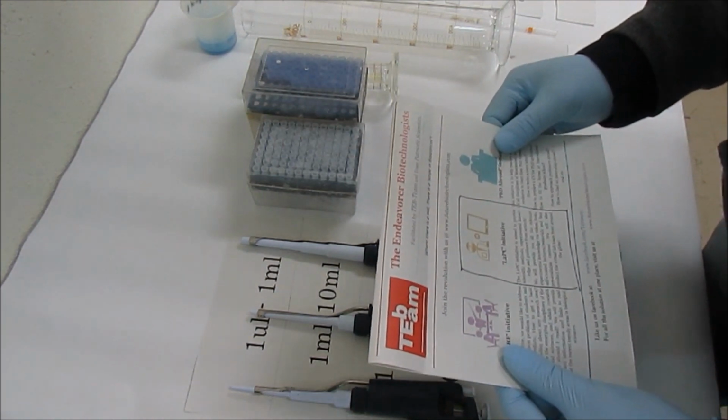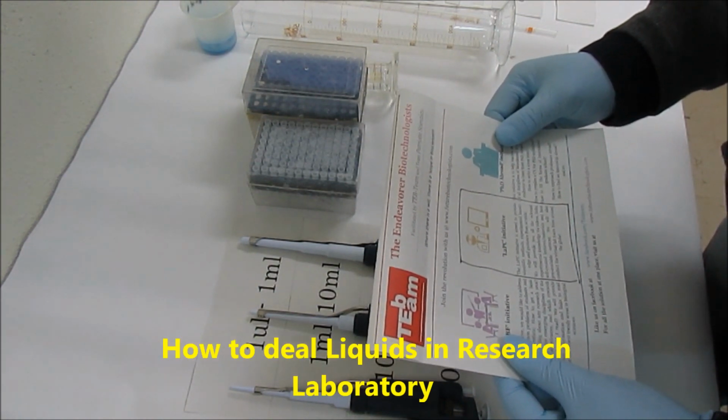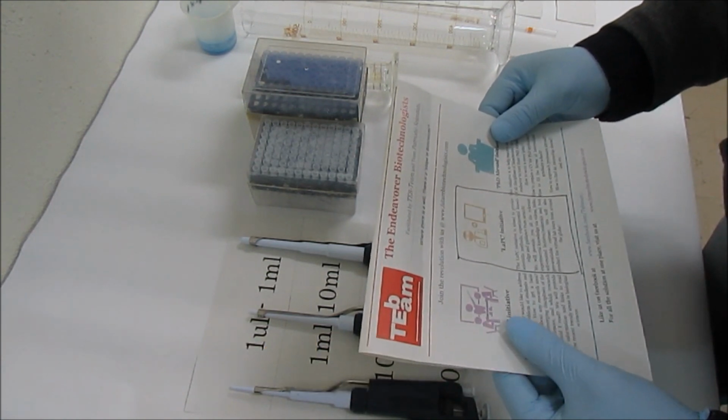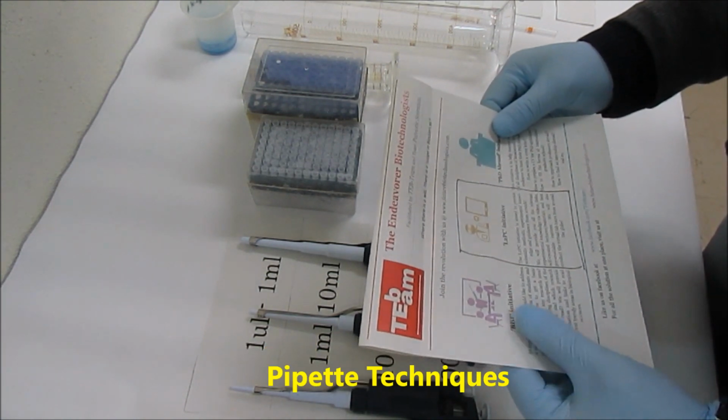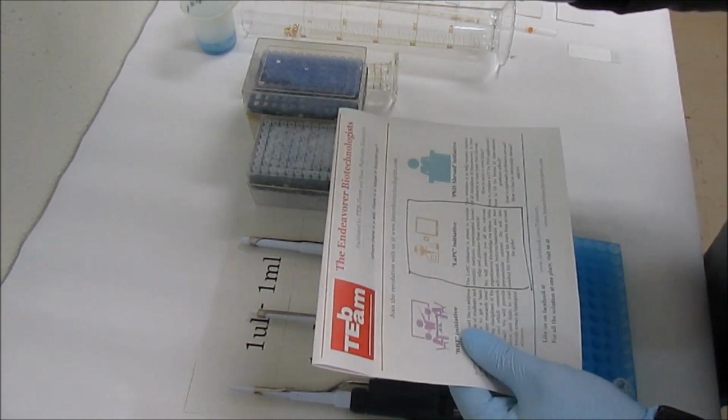So today I am going to tell you about how you deal with measuring liquids in a research laboratory, particularly focusing on pipetting techniques. This is a part of our Lab2PC initiative.